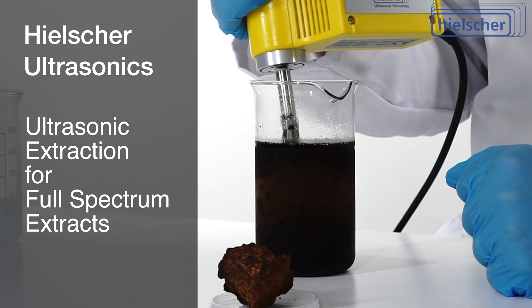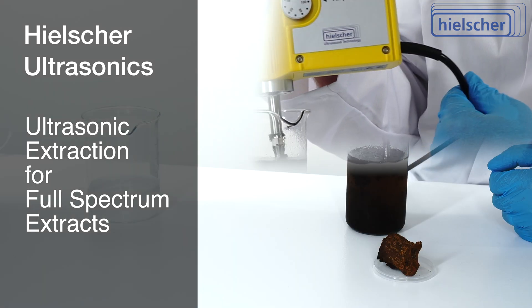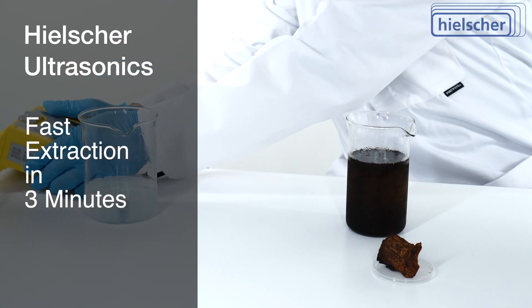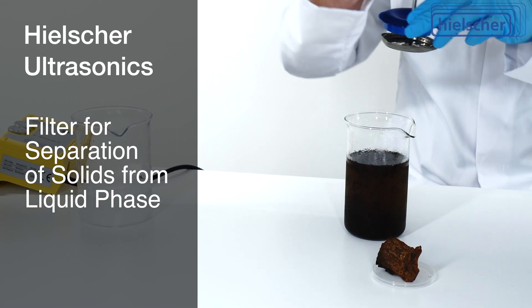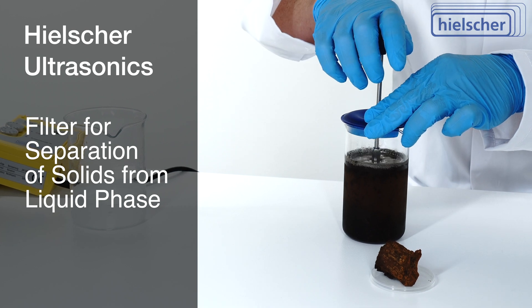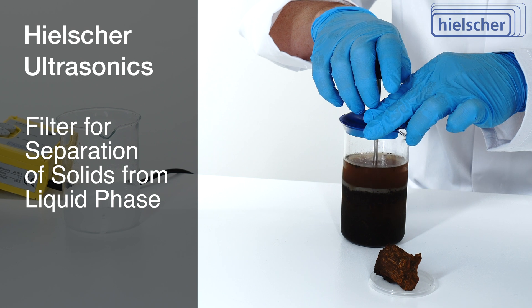Ultrasonic extraction is the perfect technique for the preparation of full-spectrum extracts. For this test, sonication is used for only 3 minutes. After sonication, we use a French press filter to separate the solids from the liquid phase. You can use any other filter, decanter, or centrifuge for the separation.